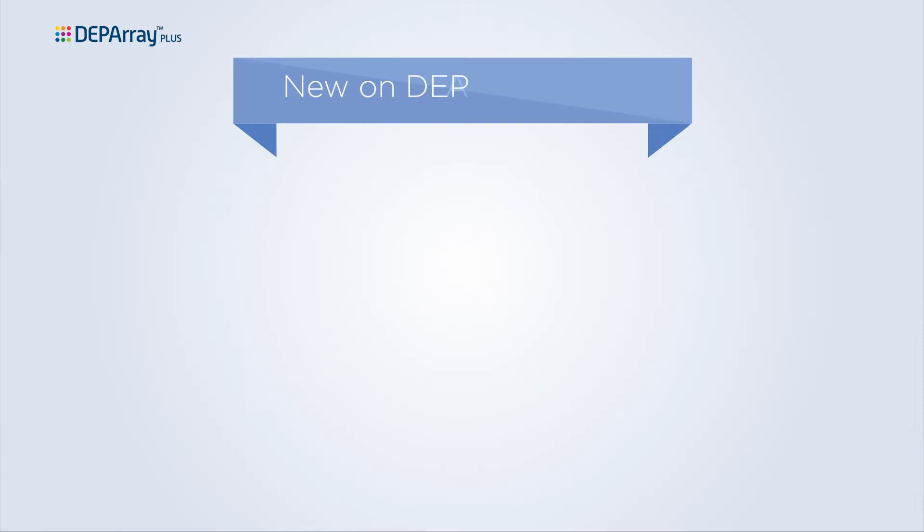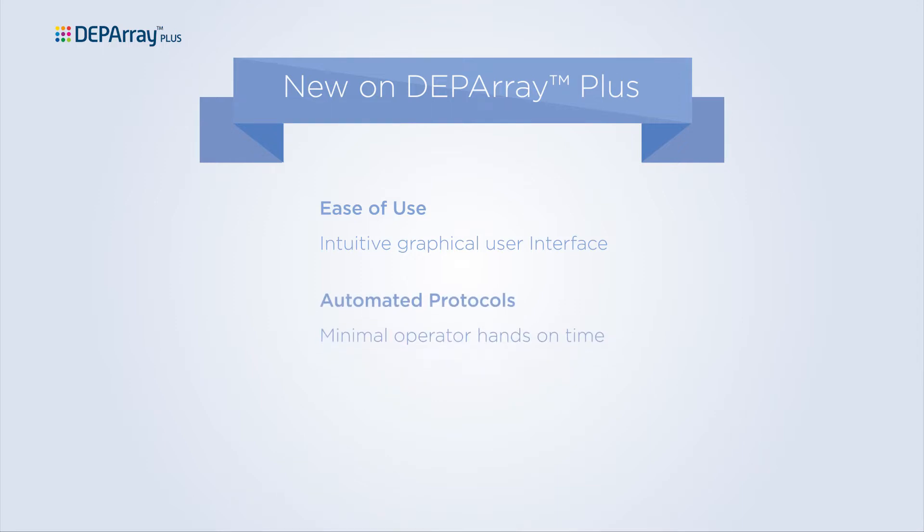The Depore Plus, latest evolution of the Depore technology, has a simple graphical interface, reduced hands-on time with automated protocols and mobile device notifications, and nine fluorescent channels with brightfield microscopy.